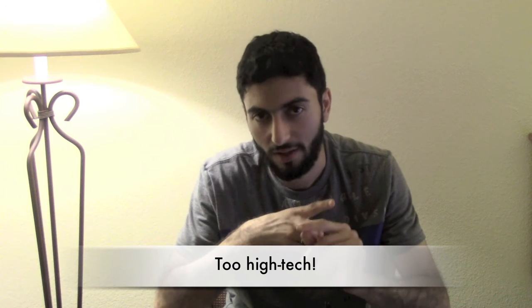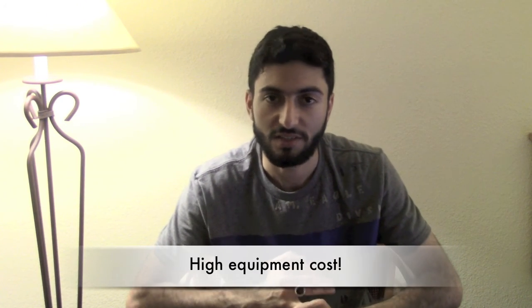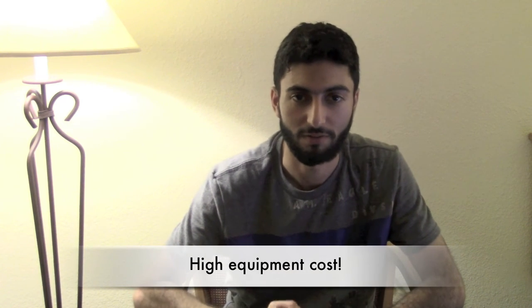On the other hand, there are two main disadvantages that are connected to each other. The first one is that it requires very high technology, which will generate very high pressures, and this high technology is not accessible to many countries, especially poor countries. In addition, those high-tech devices are very expensive, so the startup cost of buying that equipment is a very tough thing compared to other methods.